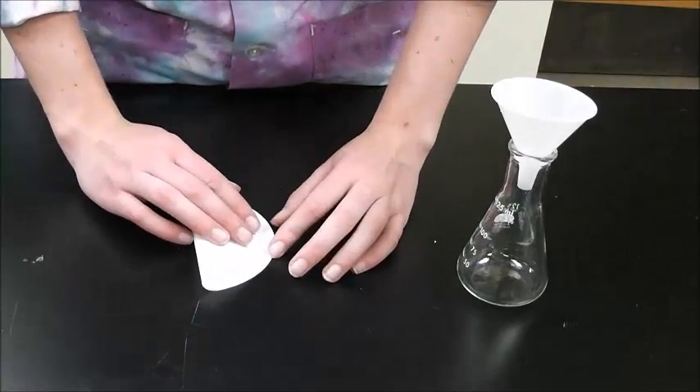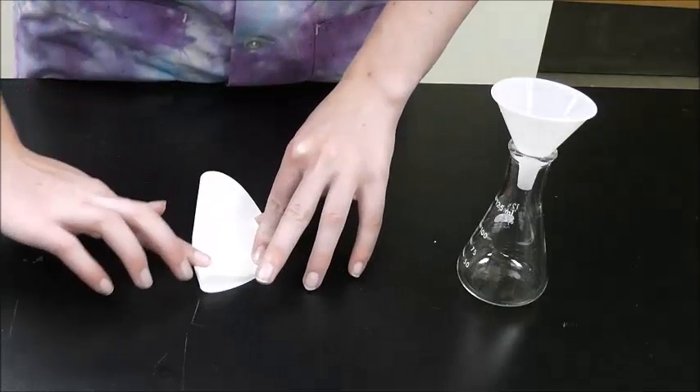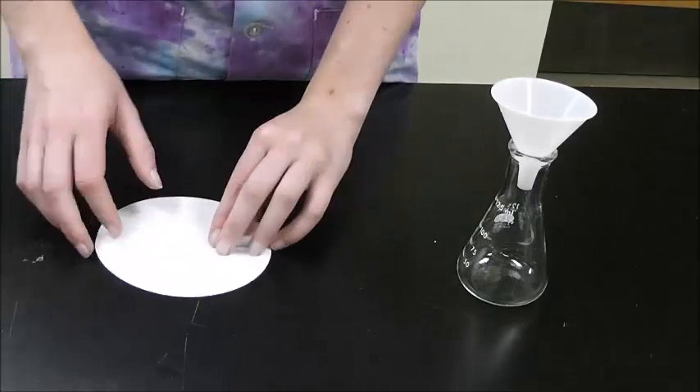To start, fold your filter paper in half. Then open it, rotate it 90 degrees, and fold it in half again.